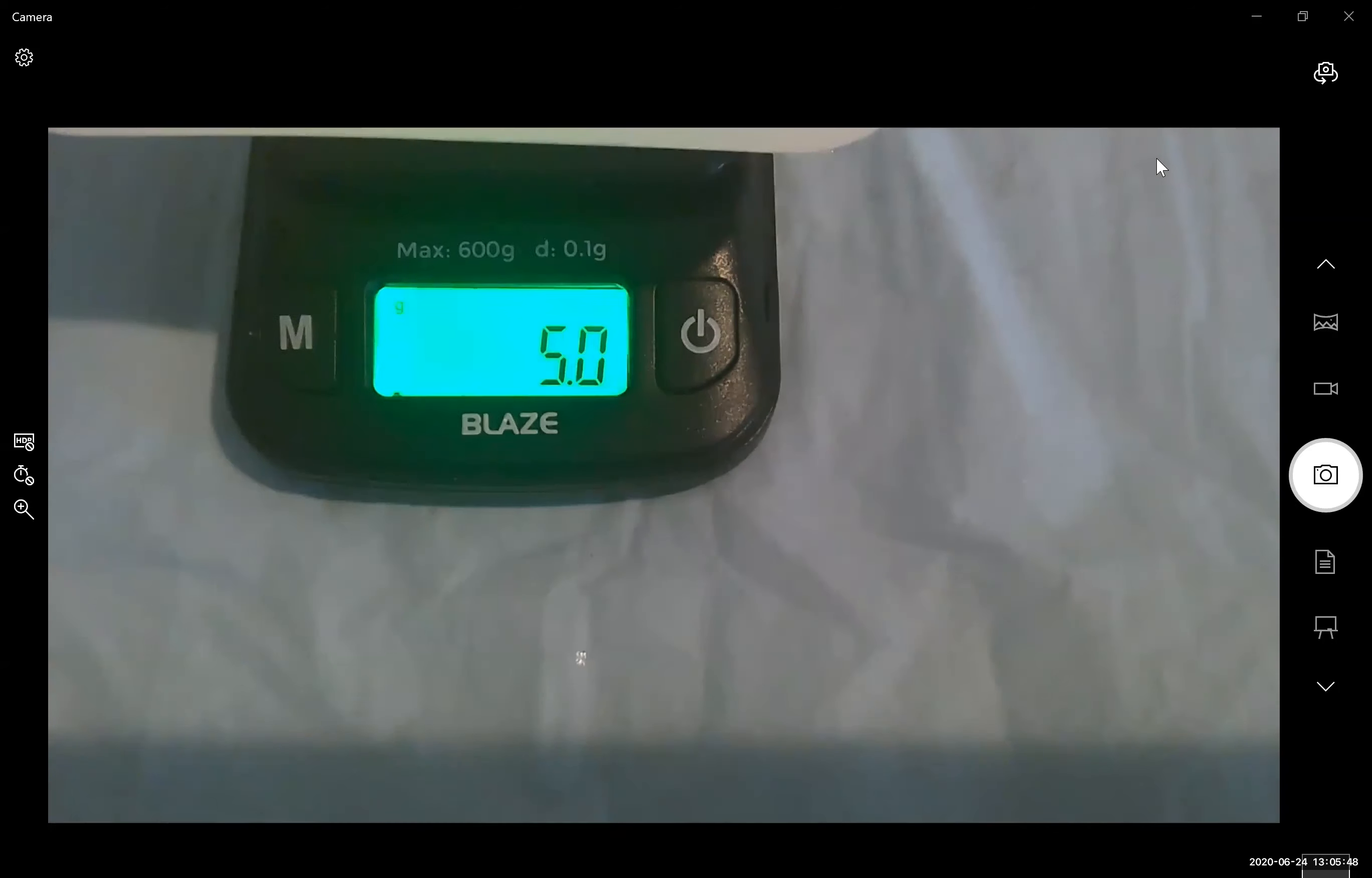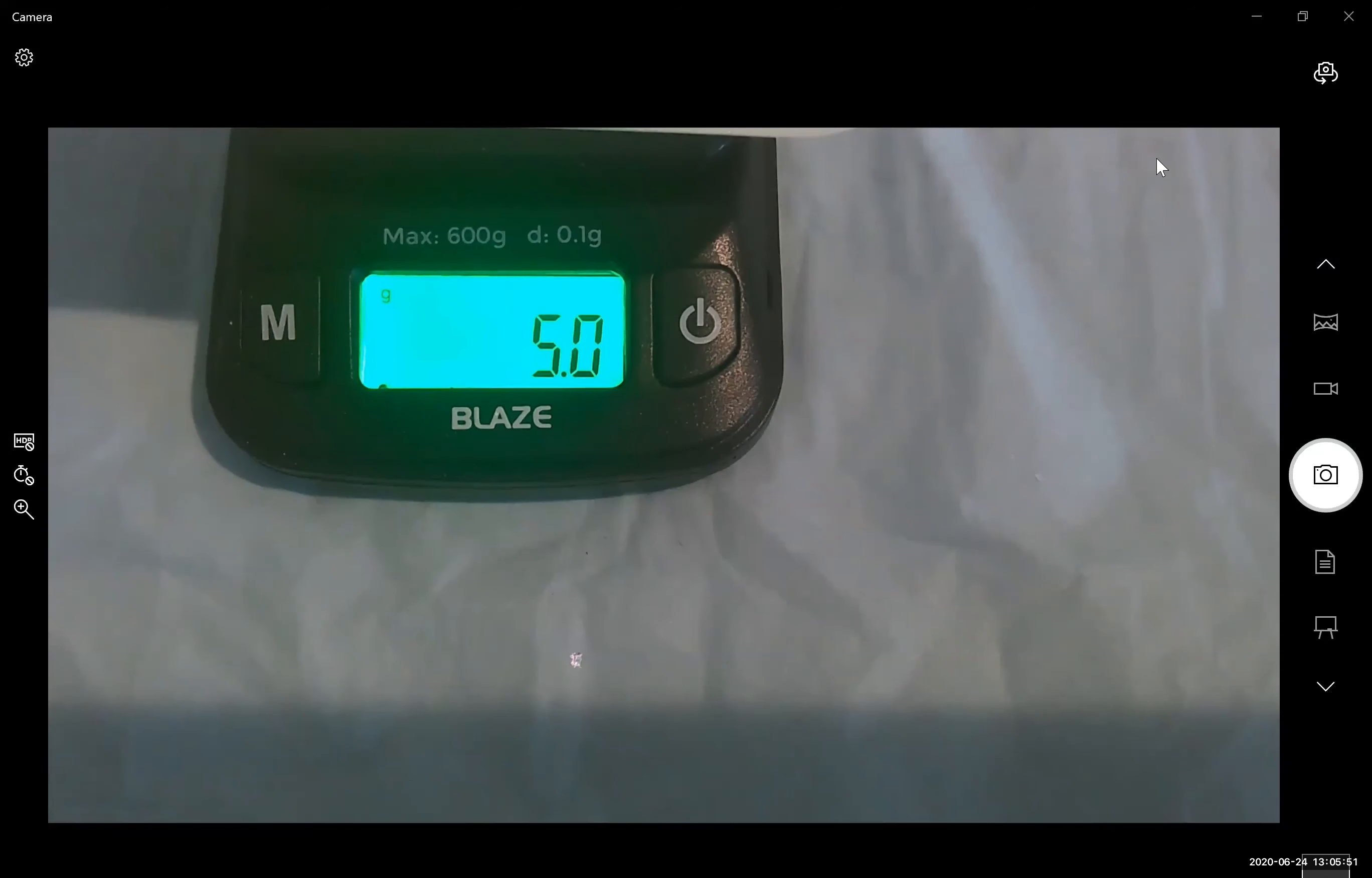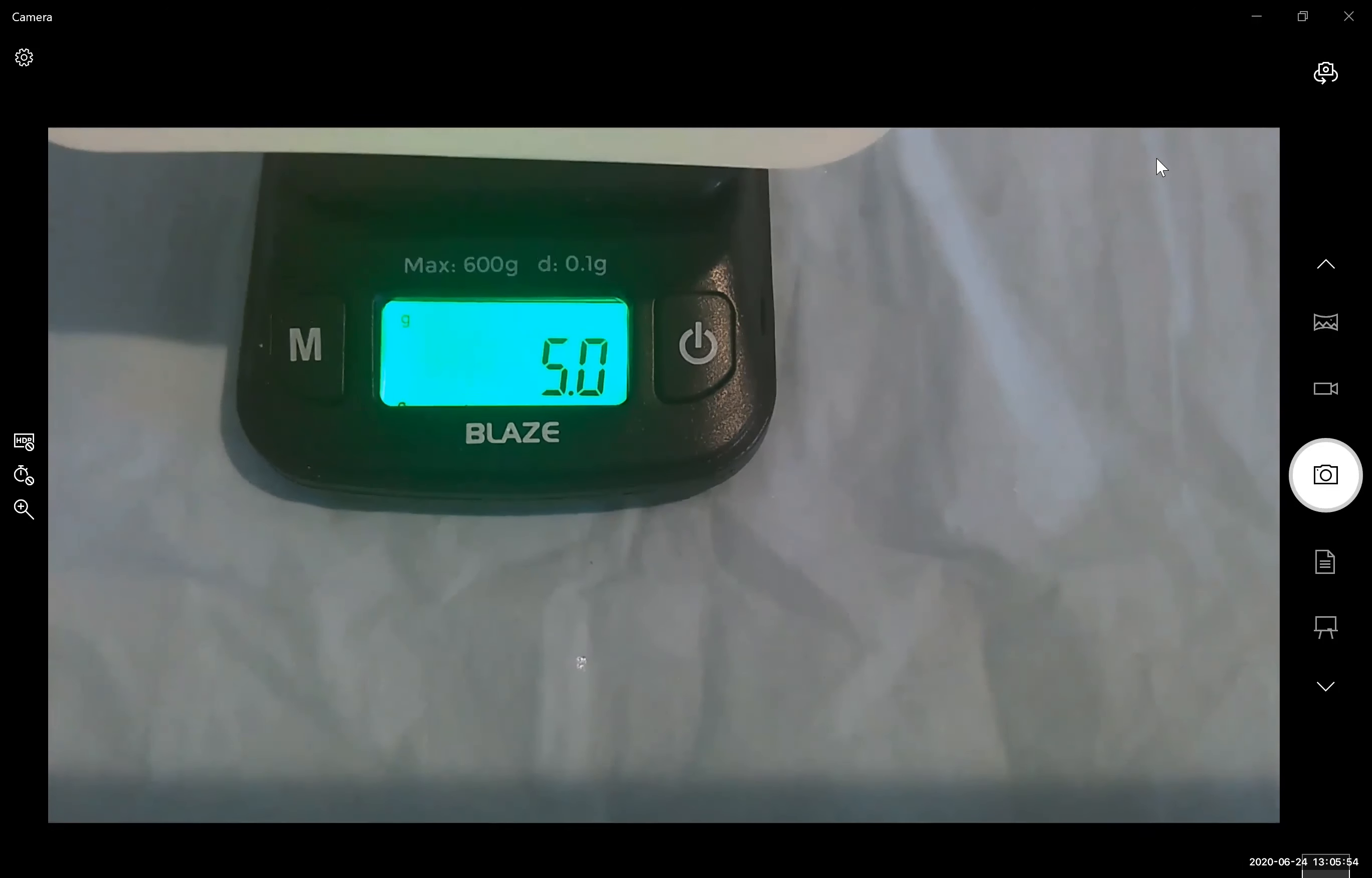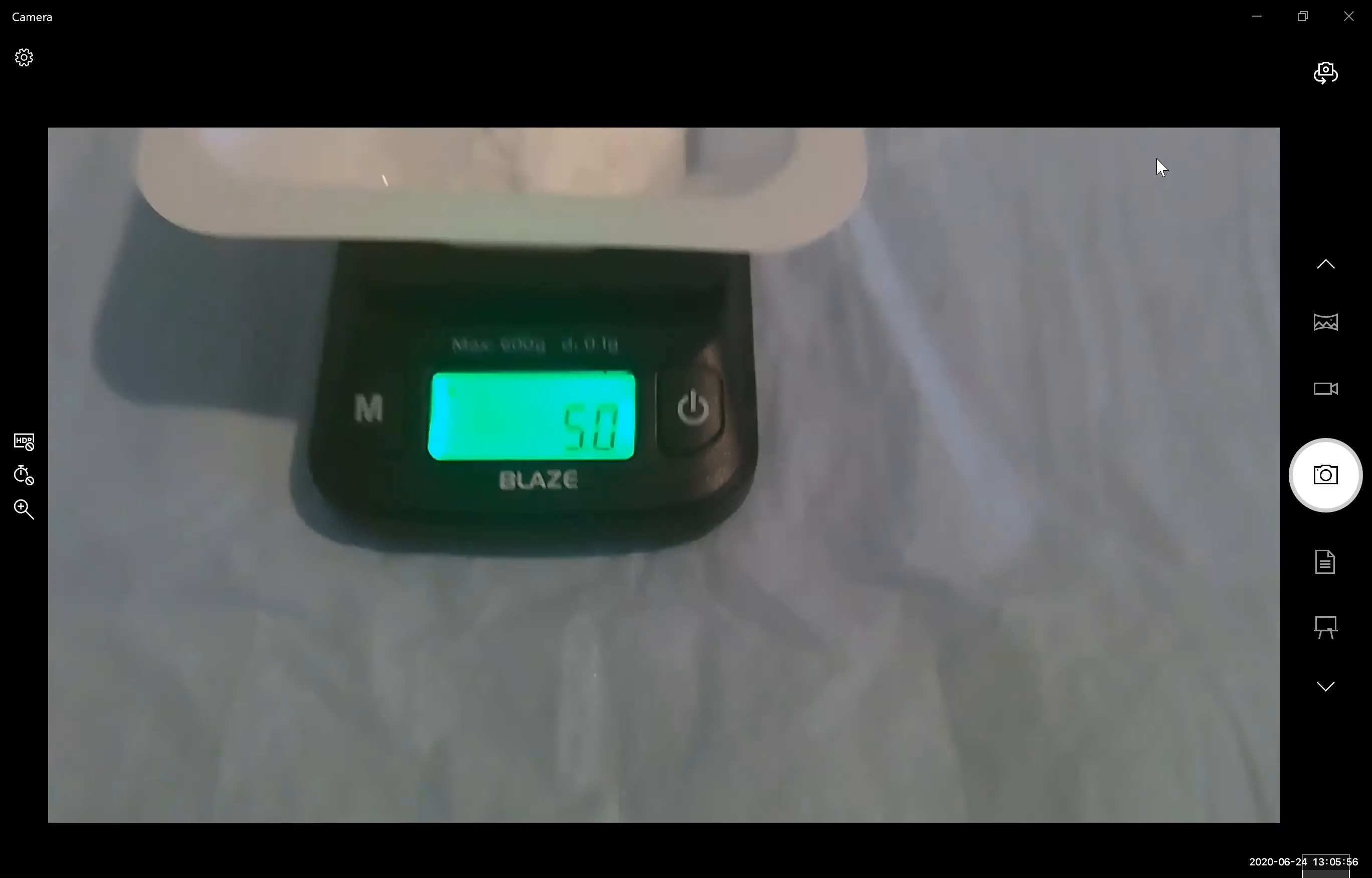And as you can see, we picked up almost two grams of water as our final mass is five grams.